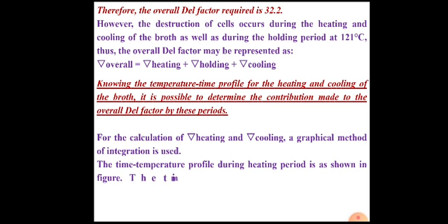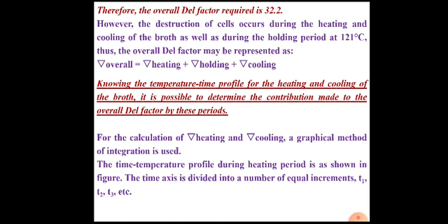The time-temperature profile during the heating period is shown in the next figure. The x-axis is the time axis and the y-axis is temperature. The time axis is divided into a number of equal increments like T1, T2, T3, T4, etc. like this.